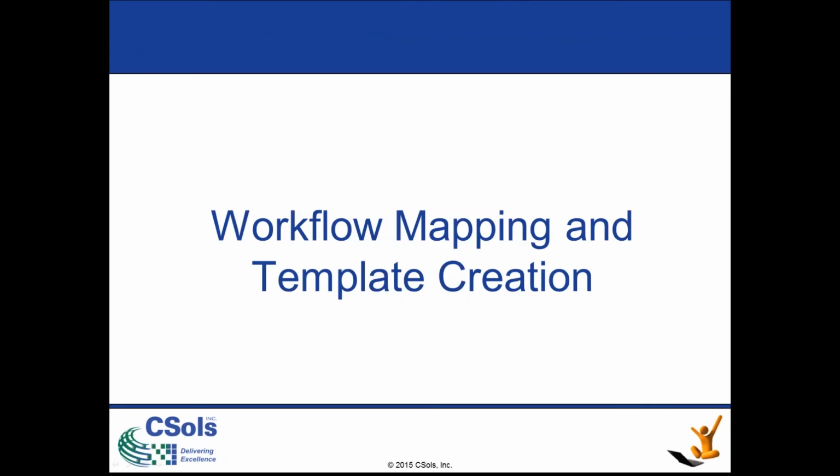So I've mentioned a lot of the problems you might be facing in your lab and with your ELN, but now I'll go into the first step of solving these problems, and that's workflow mapping. I'll also cover template creation in this section, which depends heavily on the quality of your workflow maps.